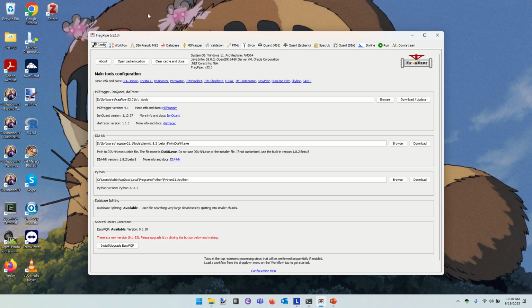And in the past, I had to argue with which specific version of Java was necessary to making the software run. So I've gone through that pain here. You don't have to. So what are we looking at? When we start with the FragPipe user interface, you might ask, what is FragPipe doing in all of this? And the answer is FragPipe is coordinating it all.